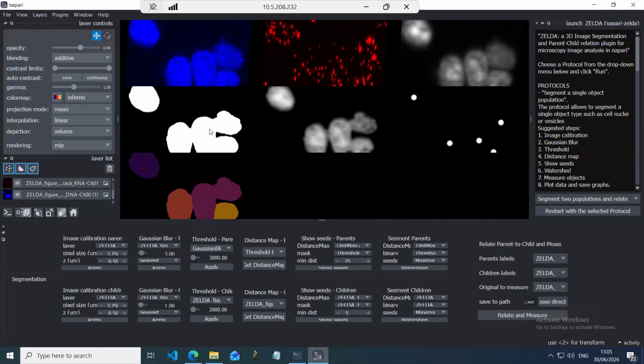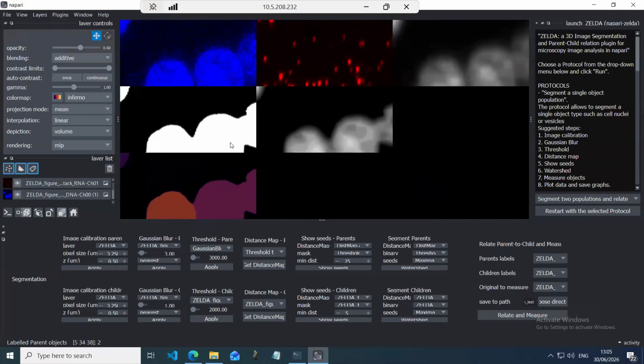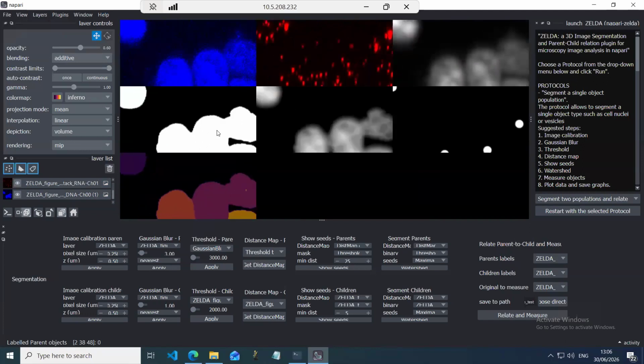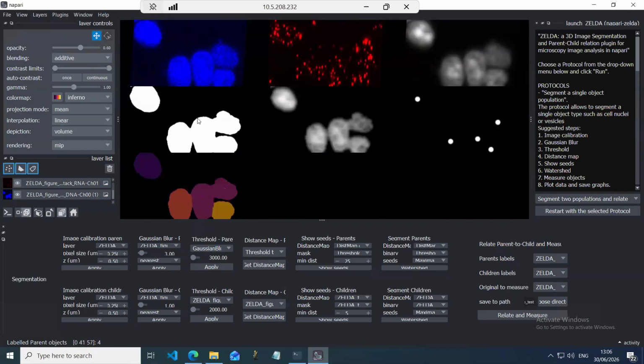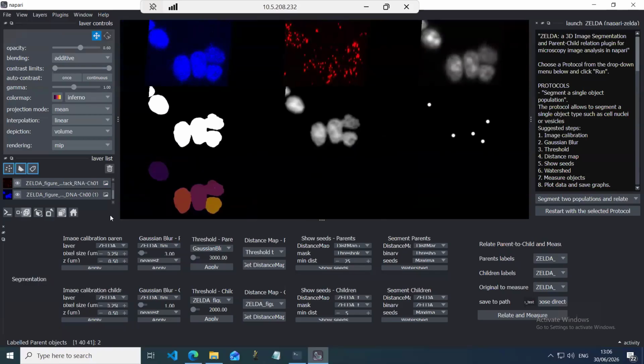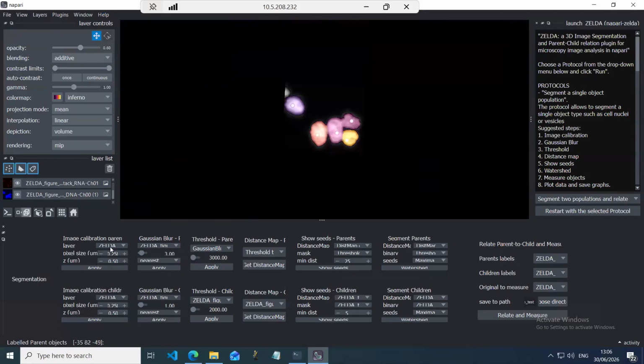So I can just try to move things around if I want to see some pictures side by side. Anyway, the navigation through the different layers is synchronized. As you can see, I can zoom in, zoom out, and try to focus my attention on specific objects. What I will do now is I revert back to the previous visualization.